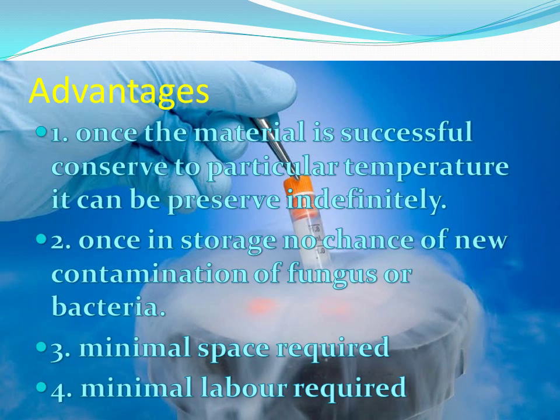Advantages. Once the material is successfully conserved at a particular temperature, it can be preserved indefinitely. Once in storage, there is no chance of new contamination by fungus or bacteria. Minimal space required, minimal labor required.